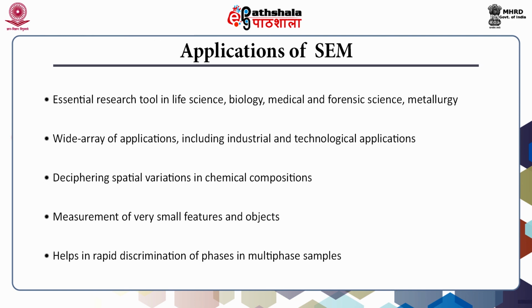Scanning electron microscopy has a number of applications which include that this technique can measure very small features and objects down to 50 nanometer in size. The technique deciphers spatial variations in chemical composition.